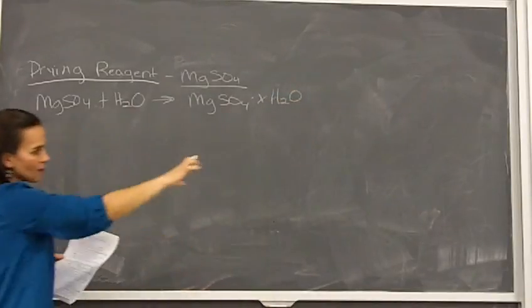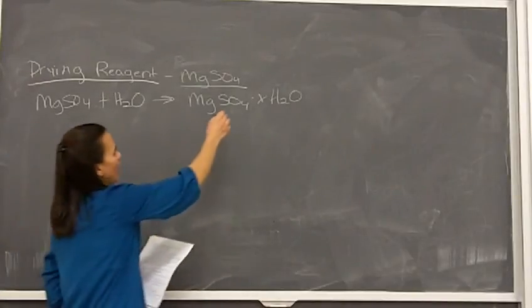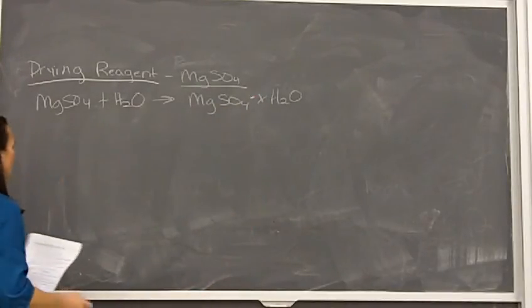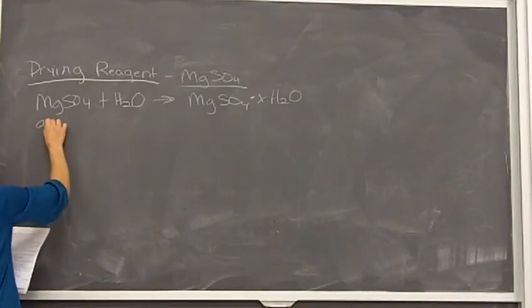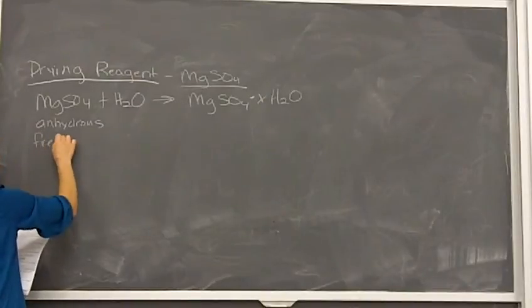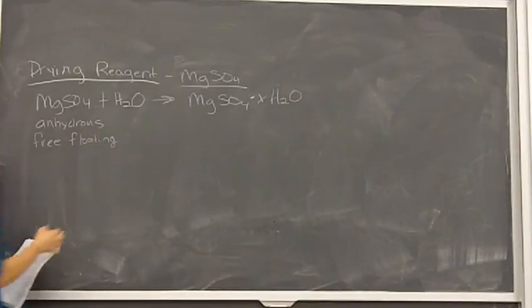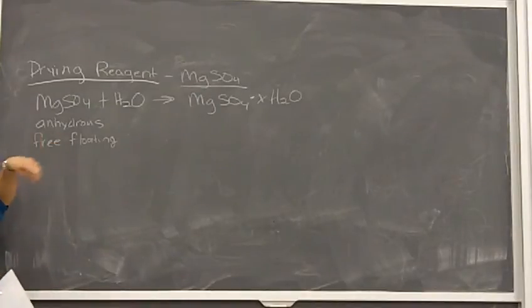Okay? So this ether layer, even though we drained the aqueous layer off of it, it's still going to have residual water in it. We need to get rid of the residual water, and so we do that by reacting it with magnesium sulfate. And the anhydrous is free floating. It looks a lot like cooking flour. Okay? So when you put it into an organic solvent, so it always has to go in an organic solvent, not in the water, that won't do us any good. It looks like flour when it's going in, or when you're dispensing it out of the container, it looks like flour.